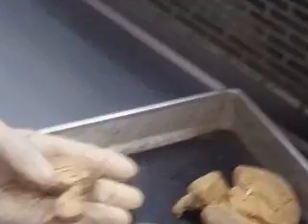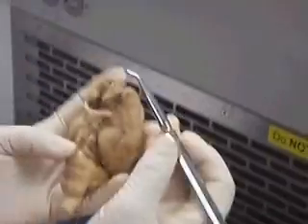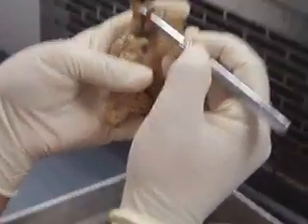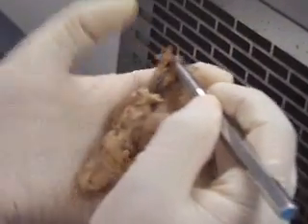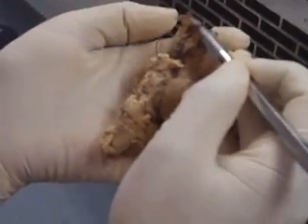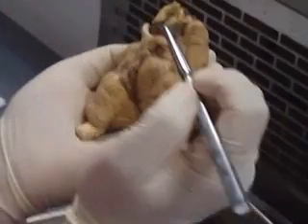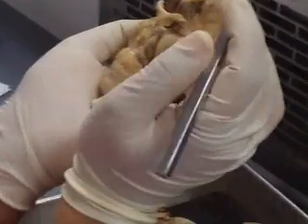Now we're going to look at the bottom of it. These are our olfactory bulbs. Within the olfactory bulbs there are 2 olfactory nerves that are our first cranial nerve, but you can't see them in there. These are our 2 olfactory bulbs. You can't see the olfactory tracts, which they talk about, so don't worry about it.